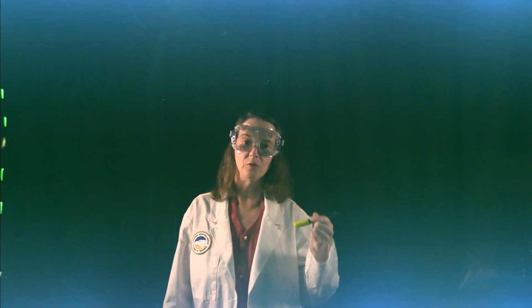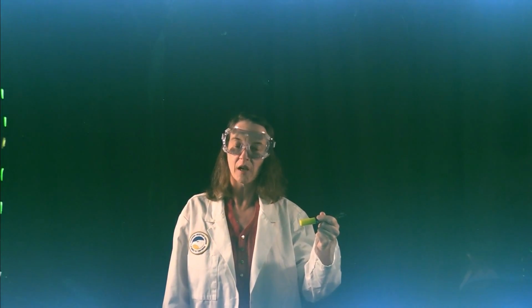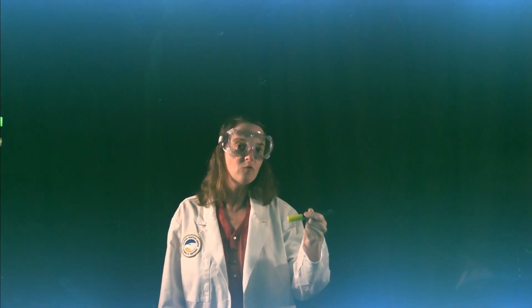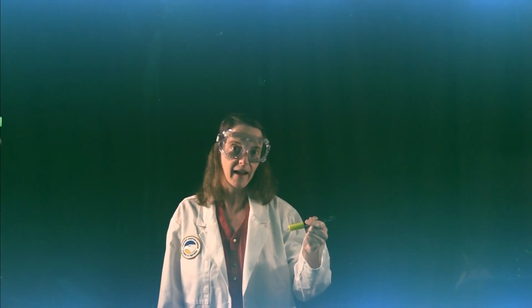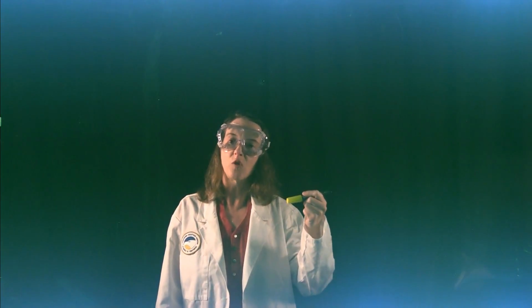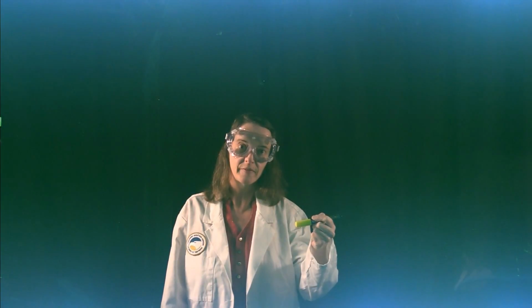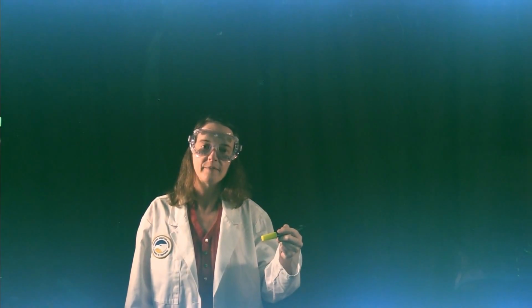What will you do? You will be analyzing standard solutions, which are solutions that have known concentrations of magnesium and calcium, and then you will prepare a tap water sample and run that sample through both the calcium and the magnesium spectrometers. How does it work?